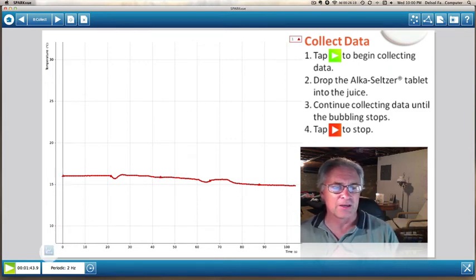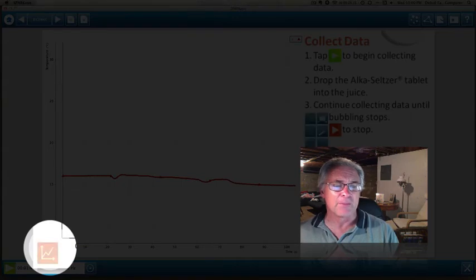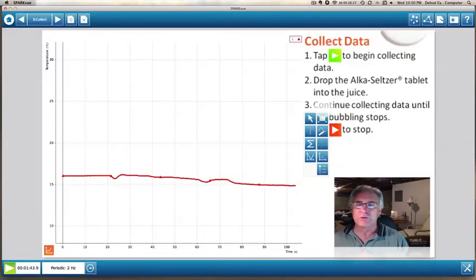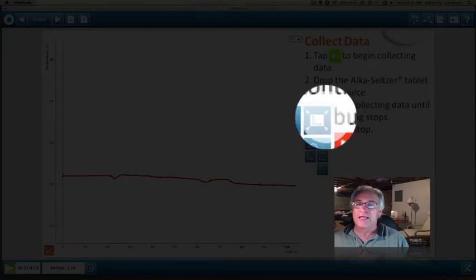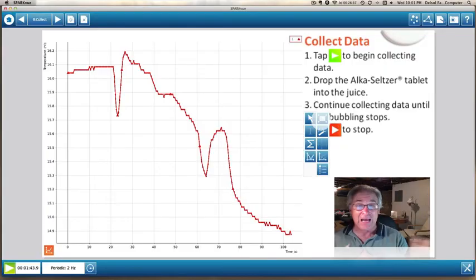So what we're going to do is we're going to click this blue button on the lower left. And that button is going to bring a pile of tools. And one of the tools, you can see the icon of this graph. And then you'll also notice that it has arrows. And when I click, that's called the auto scale. When I click it, now you can see a huge difference because we're talking about tenths of a degree. Now we have quite a bit different type of look.